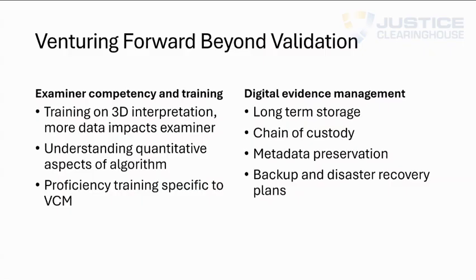We're going to have to know basically how it works and what it is trying to demonstrate. And then proficiency training, which is specific to VCM. Not only a means of evaluating the correspondence in known matching and known non-matching scenarios, but also actual proficiency testing as well, focused on virtual comparison microscopy.